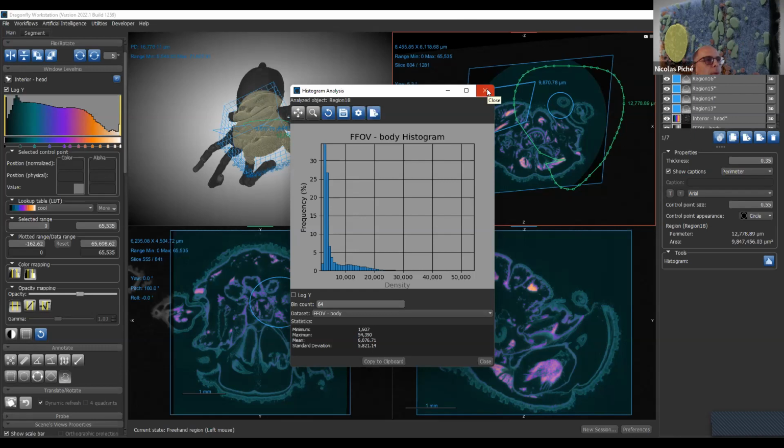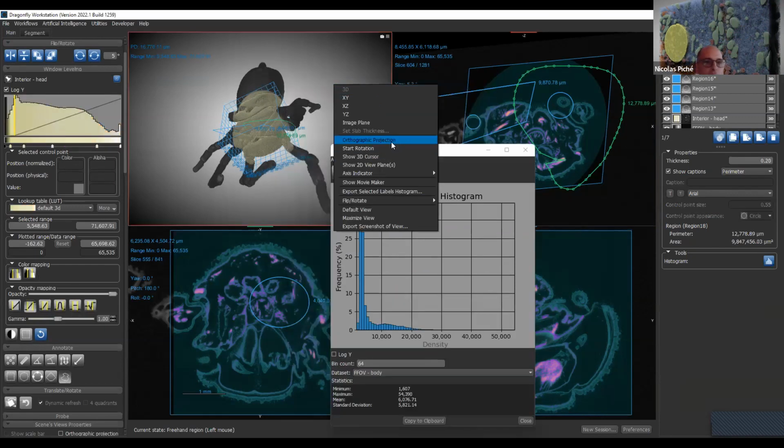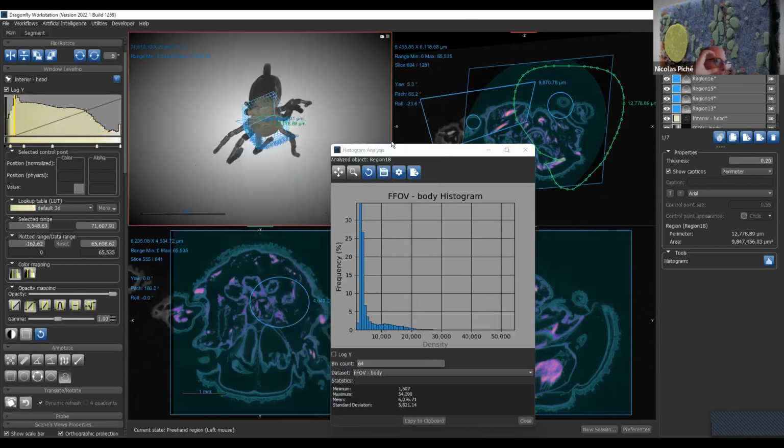When you make such a shift, can you perfectly dimension from the histogram? No, but in fact, what you can do is chop the data set in 3D and make a region of interest that is a cone based on that. If you're in perspective, it will be something conic. If you put yourself in orthographic projection, it will be a perfect cylinder.